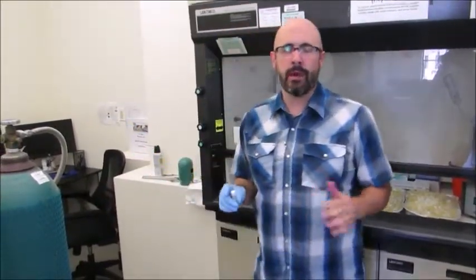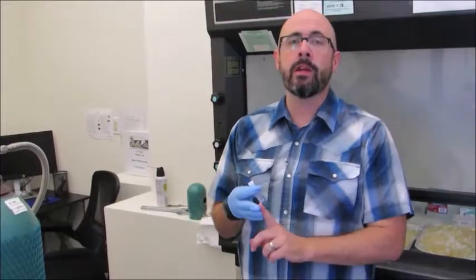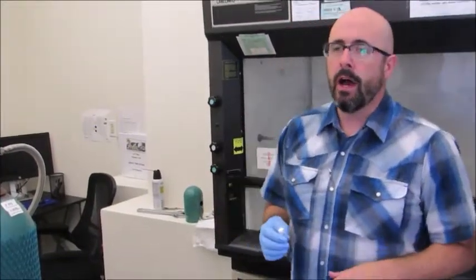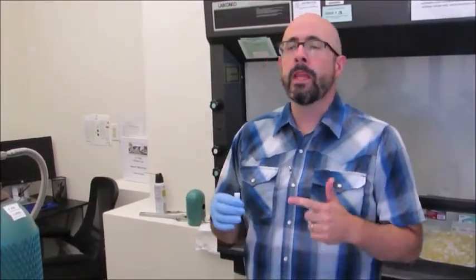So we just saw where we measure the daughter products in the uranium, thorium, helium system on the helium analysis machine. And that's the first thing that we measure. But of course, to calculate a date, we also need to know the parent isotope concentrations. In this case, we need to measure the uranium, thorium, and samarium content of our crystals. The technique requires us to understand the total amount of uranium, thorium, and samarium in our crystal.